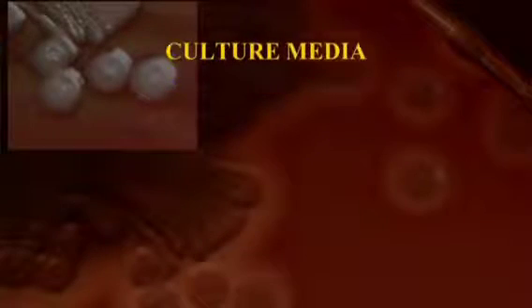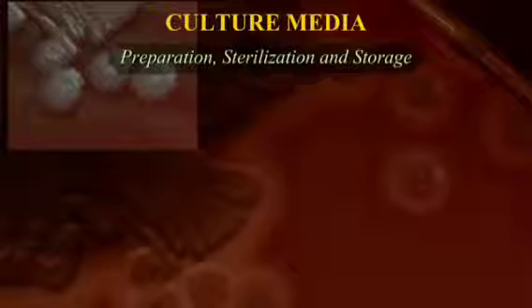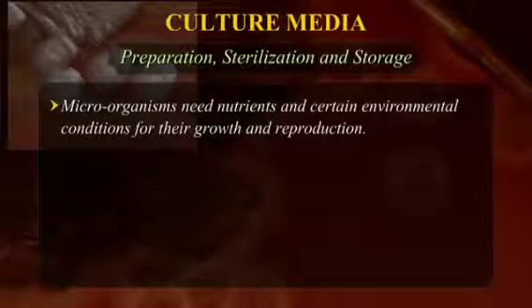Culture media, preparation, sterilization, and storage. Like everything living, microorganisms too need nutrients, a source of energy, and certain environmental conditions for their growth and reproduction.